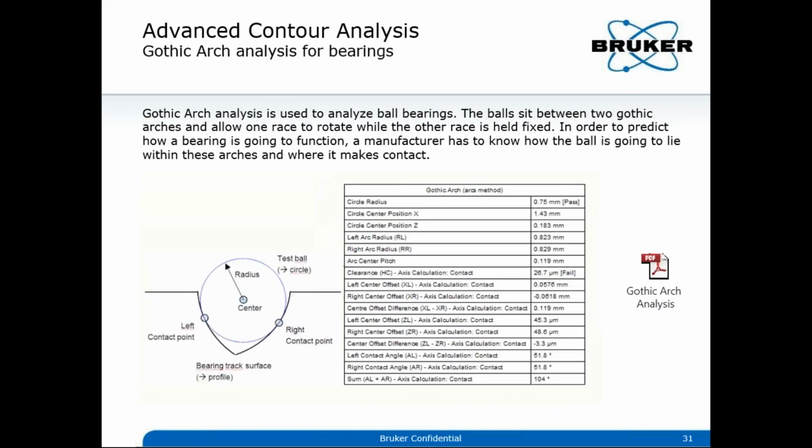And there are other advanced contour analyses that include analysis for bearings. If your company is making bearings, these are customized parameters only needed by manufacturers of ball bearings.